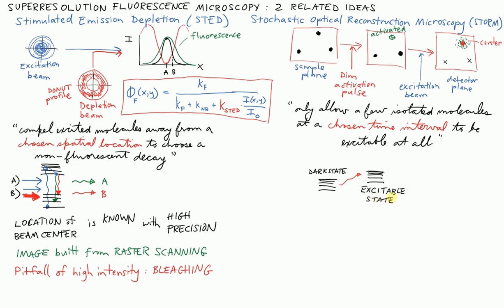The excitable state is capable, if we have an upper state up here, of absorbing a blue photon and emitting a green photon. And it goes through this cycle n times, where n is the number of photons that I collect from that fluorophore before eventually something ends the process. It gets stuck somewhere and you get a certain number of photons out, and the STORM gets better and better the more cycles you can put it through, because you can calculate the center better and better.